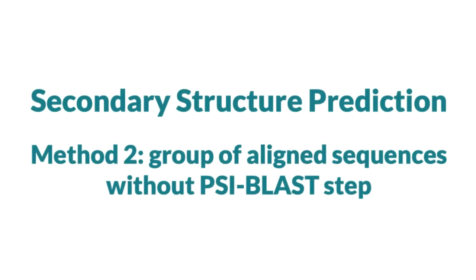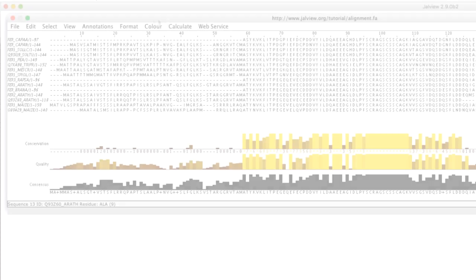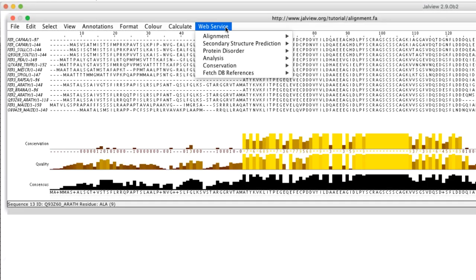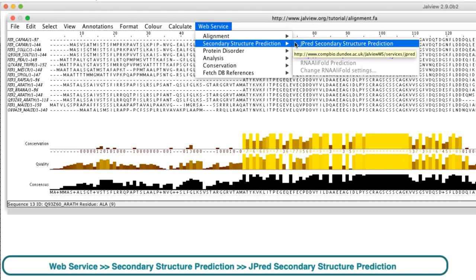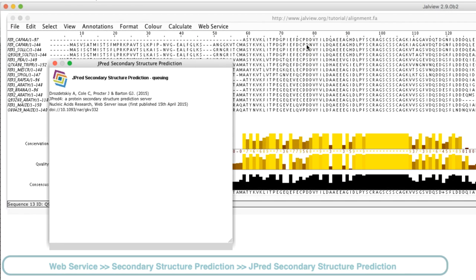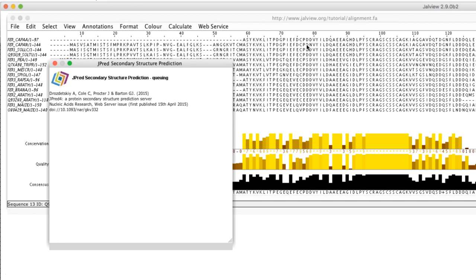If no sequence is selected and the sequences are aligned, then JPRED will not perform the PSI-BLAST step. Instead, it uses the current alignment as a profile to perform the Secondary Structure Prediction. And JPRED will use the first sequence in the alignment for its prediction.